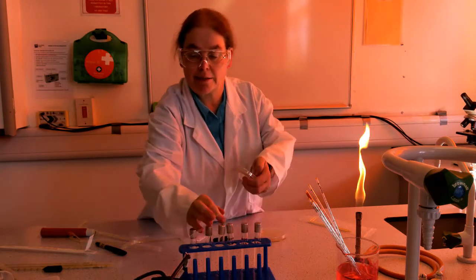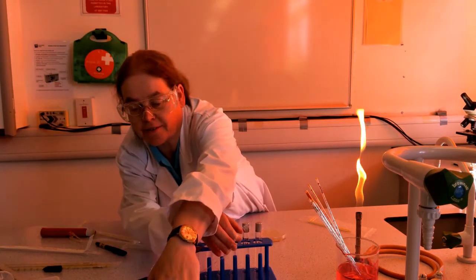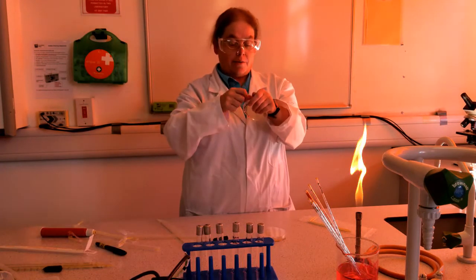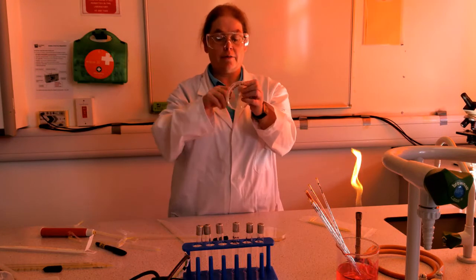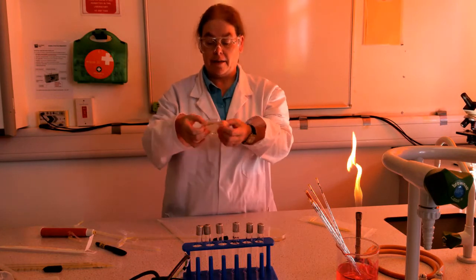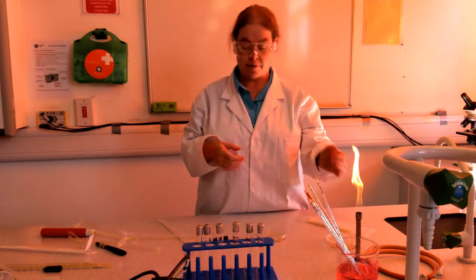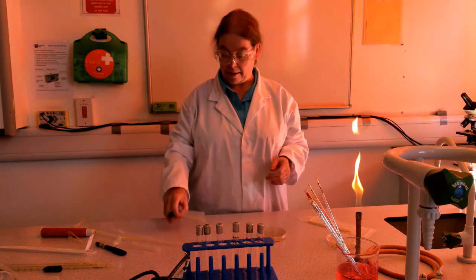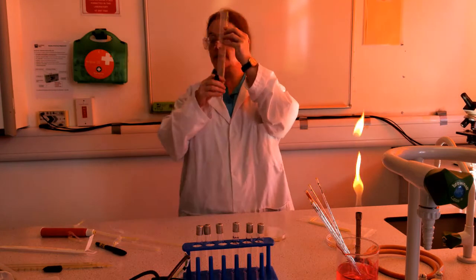That's the best place to put the sellotape so that it wasn't in the way of the camera. I'll probably come back and do that better when I've finished recording. And then carry on and do my 1,000,000 dilution in the same way.